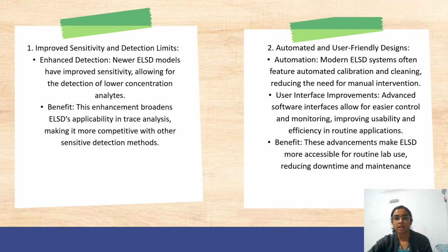Second is automated and user-friendly design. Automation: modern ELSD systems offer features like automated calibration and cleaning, reducing the need for manual intervention. User interface improvement: advanced software interfaces allow for easier control and monitoring, improving usability and efficiency in routine applications. It is beneficial: this advancement makes ELSD more accessible for routine lab use, reducing downtime and maintenance.